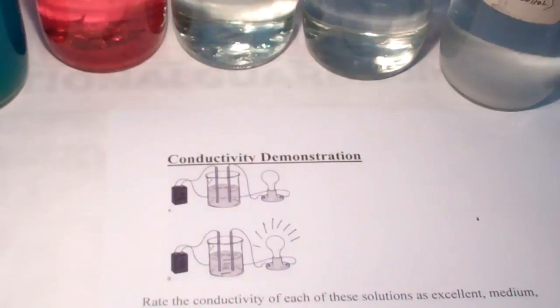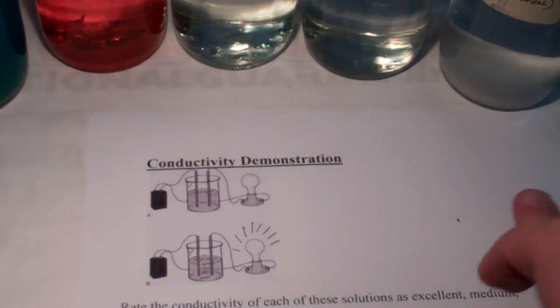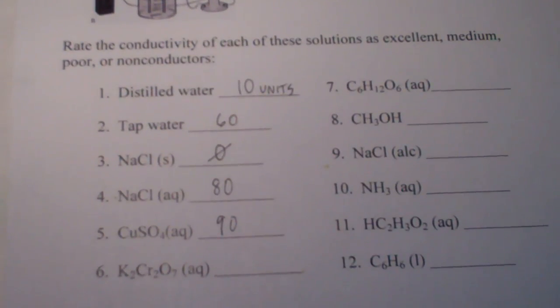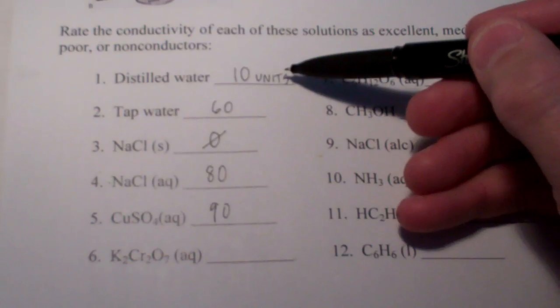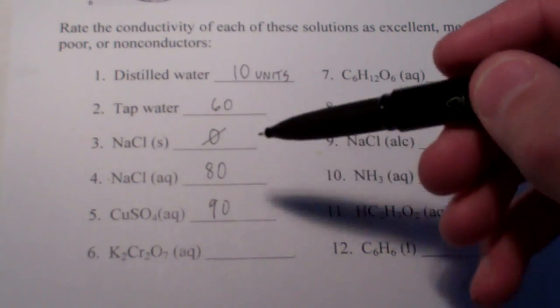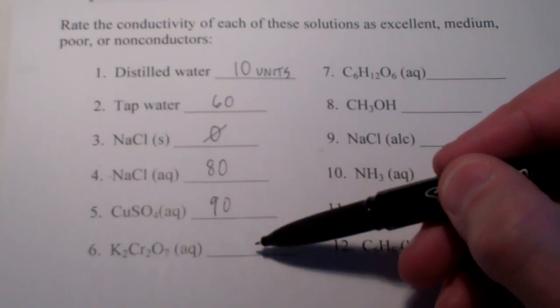So, put a lid on that. And we'll record that in our data table at 90 of our conductivity units. So, let's press this paper up, make sure you guys can see our data so far. 10 for distilled water, 60 for tap. Sodium chloride solid, zero. Sodium chloride dissolved in water, 80. Copper sulfate dissolved in water, 90.